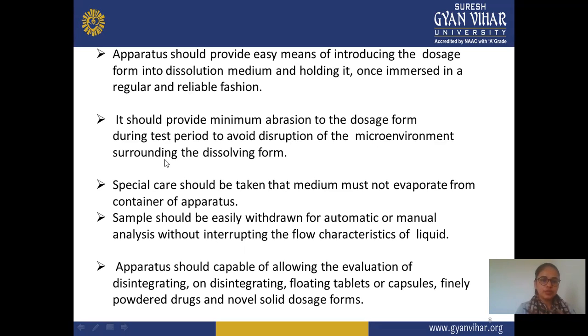And next, special care should be taken that the medium must not evaporate from the container of the apparatus. Means if your solution is volatile in nature or evaporates easily, you should take special precautions so that the medium does not evaporate from the container of the dissolution apparatus. It should remain in a stable form and its volume should not reduce while performing this test. So take care that your buffer solution or any other solution stays at the specified volume and does not evaporate.